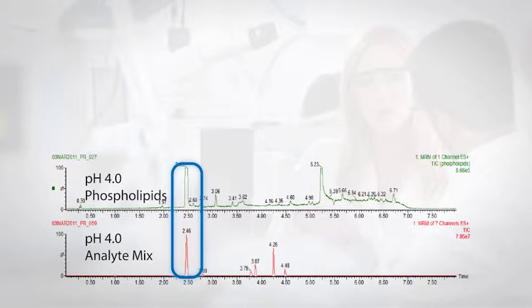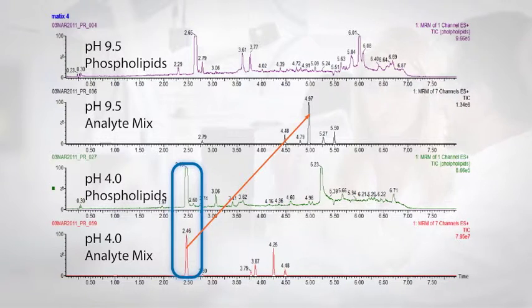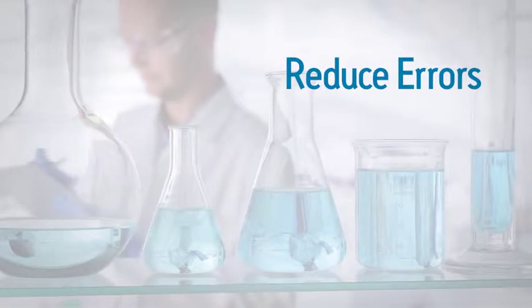In this bioanalysis example, the analyte of interest coelutes with the phospholipid interference, resulting in suppressed ionization and loss of sensitivity. When Auto Blend Plus is used to create a pH 9.5 mobile phase, the analyte is moved to later retention away from the interference, which greatly improves sensitivity. Using Auto Blend Plus reduces errors in preparation of the mobile phases, making your preparation easier, more reliable, and more accurate.